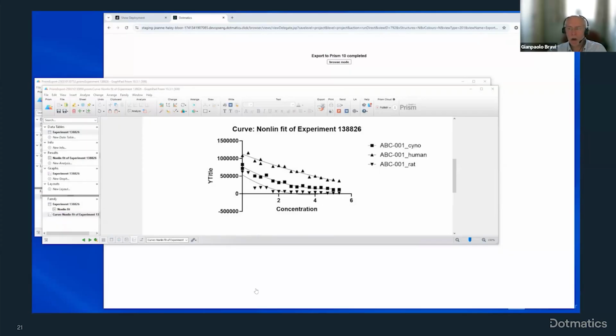Okay, we have reached the halfway point, and I'm going to pass the ball to Troy, who will give you further information on the integration between ELN and Prism. Thank you, Java. Let's see if you can stop sharing. That'll allow me to share.